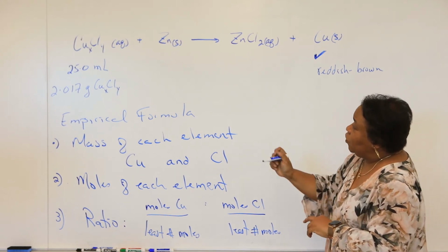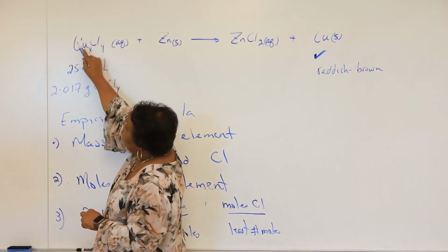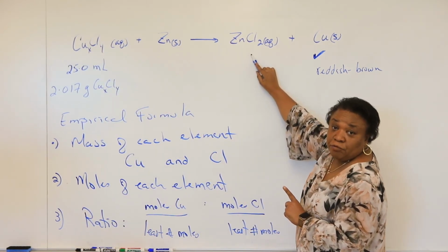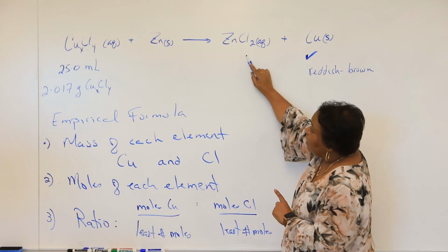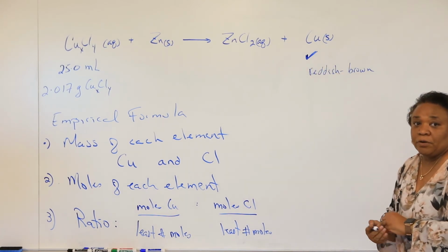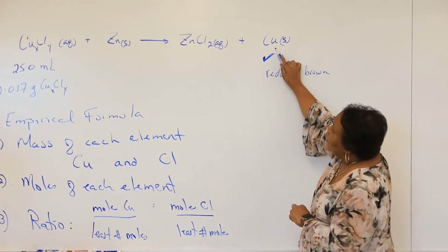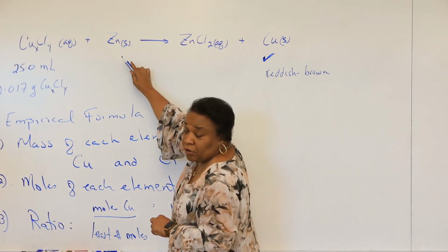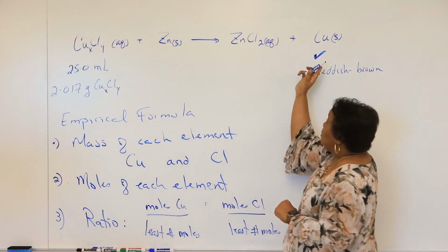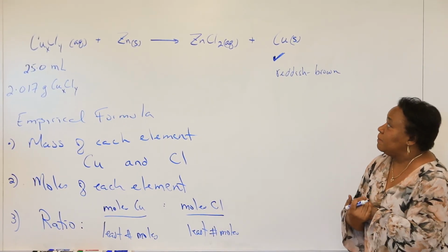In addition to that, we're going to make sure that all of our copper chloride solution, that blue color, is converted, completely reacts to give us our clear colorless aqueous solution. And then we're going to have our deposit of what? Of copper. But there's a few issues here. Please recognize that some of the copper metal is going to adhere to the zinc. So care must be taken to remove that solid copper from that excess zinc material.